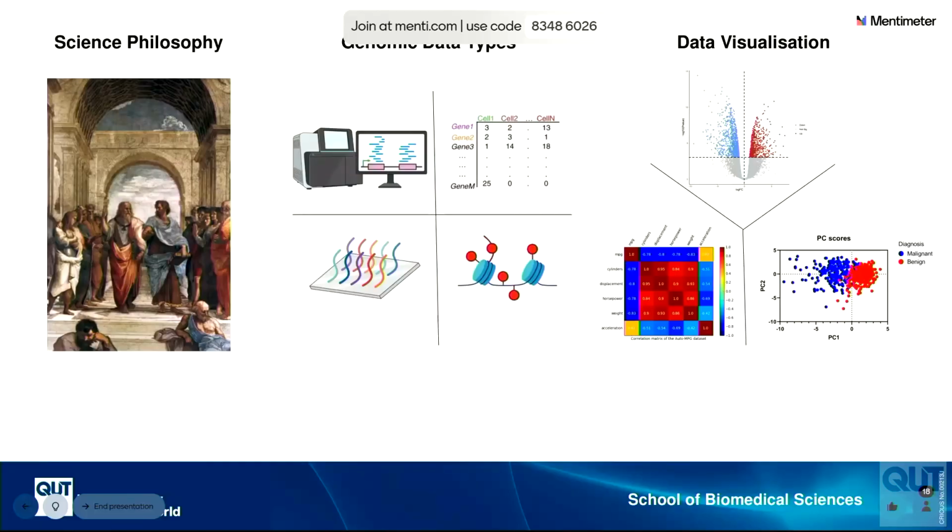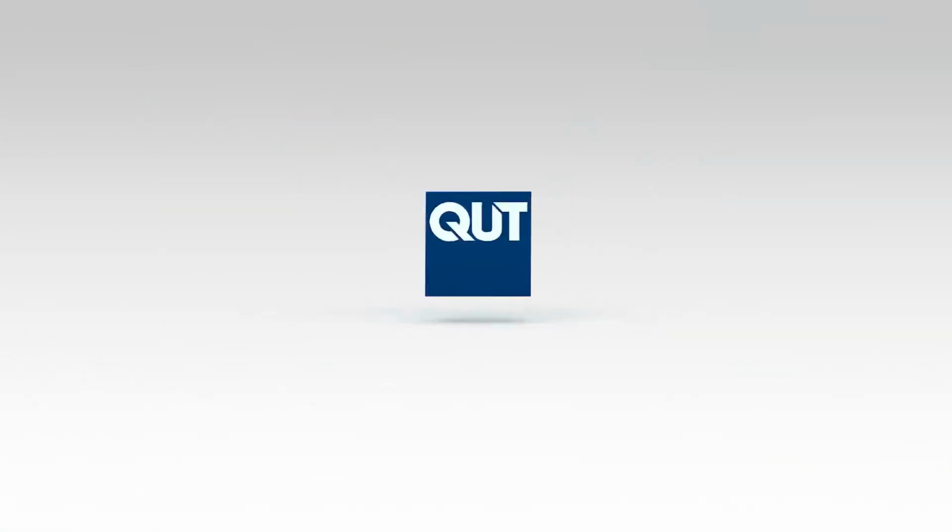As a group, yes. In this example here, even though there is a little bit of an overlap, I would say as a group, they do separate enough. It doesn't tell you what's different. It just tells you if there's a difference. And even, would that be overlapping in the middle? Oh, yeah. Yes, yes.